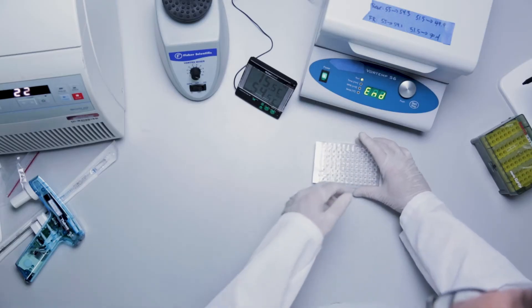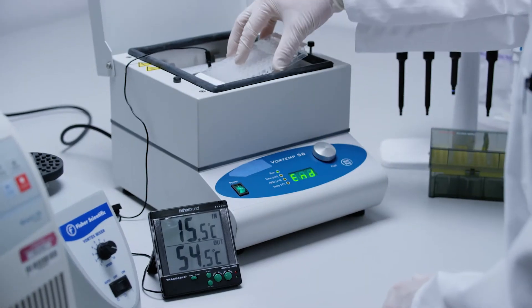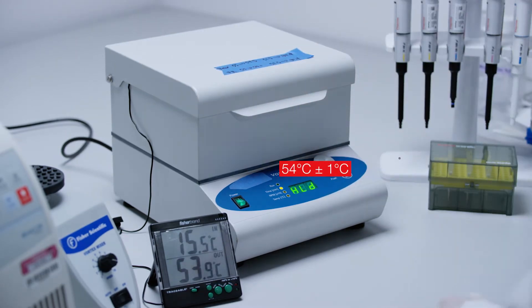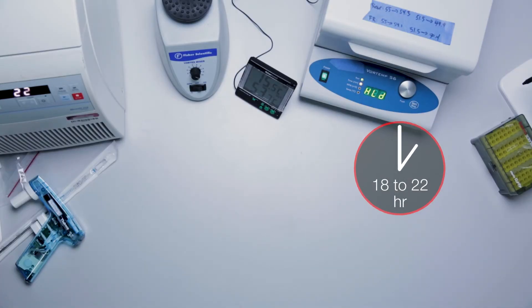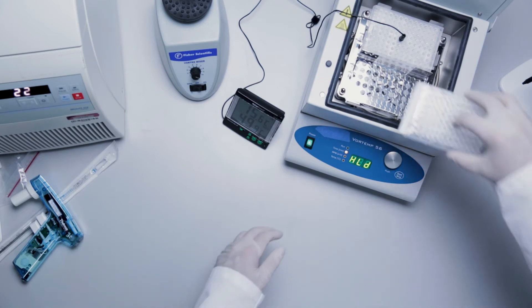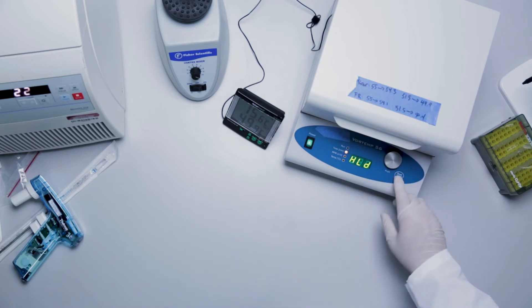Place the hybridization plate in the shaking incubator for 18 to 22 hours, set at 54 degrees Celsius plus or minus 1 degree Celsius, at 600 RPM with the Vortemp incubator, or 300 RPM with the Max-Q incubator. If using a Vortemp incubator, ensure there is an inverted platelet in place as explained by the package insert and supplemental video. Before leaving the lab, make sure the incubator is stable for overnight shaking incubation.